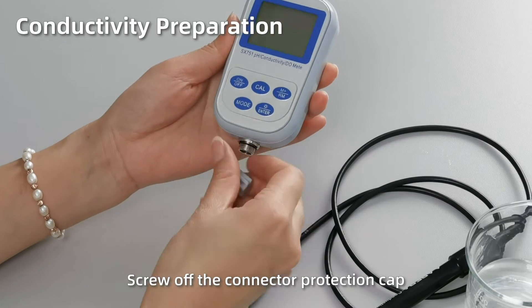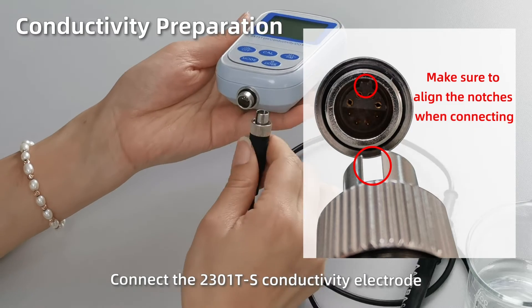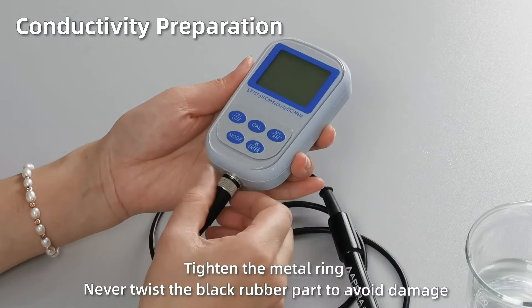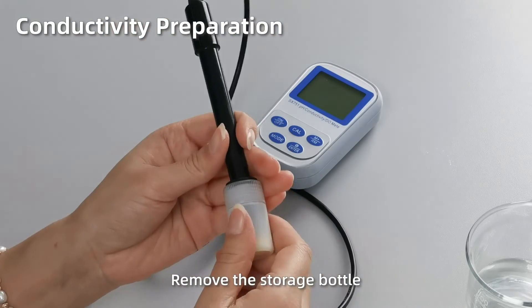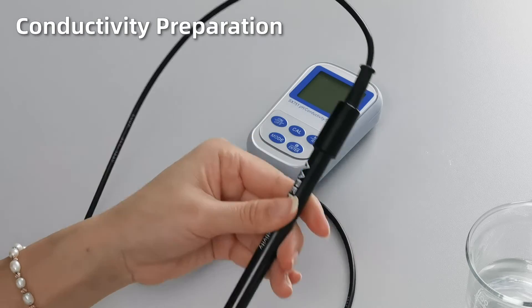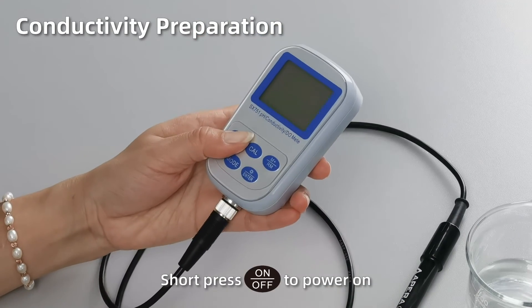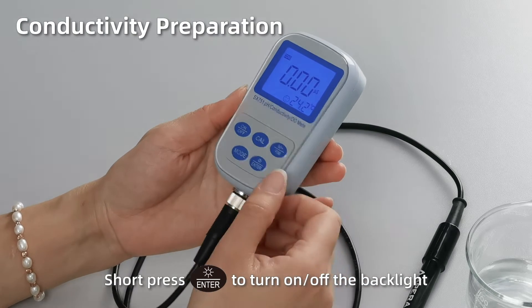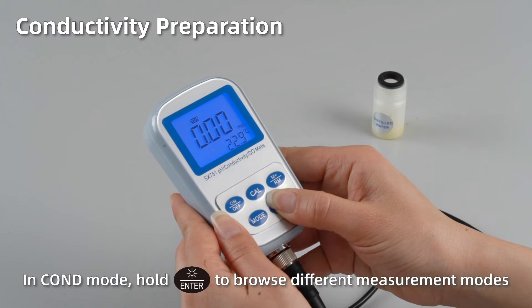Connect the 2301TS conductivity electrode. Make sure to align the notches when connecting. Tighten the metal ring. Never twist the black rubber part to avoid damage. Remove the storage bottle. Short press on to power on. Short press enter to turn on or turn off the backlight. In conductivity mode, hold enter to browse different measurement modes.